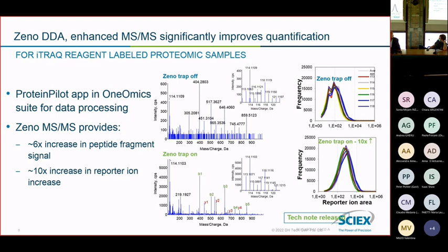But the other point to consider is the size of the ion trap, right? Because when you relate that to the negative effects that you can have with a carrier channel, for those of you who are maybe more aware, you realize that the size of the trap matters, even in other instruments as well. So that's why the ones that had the biggest ion capacity are used preferentially, in order to mitigate this issue. So the capacity of the Zeno trap is the largest.